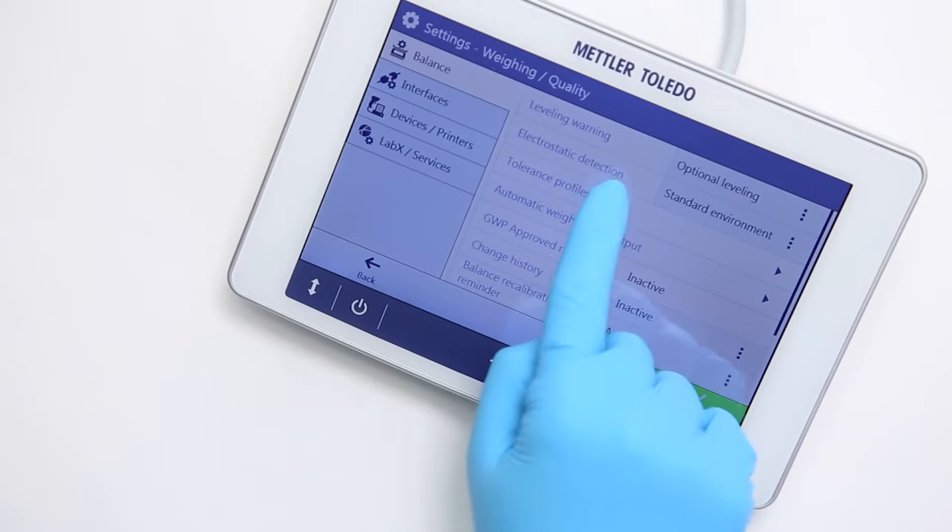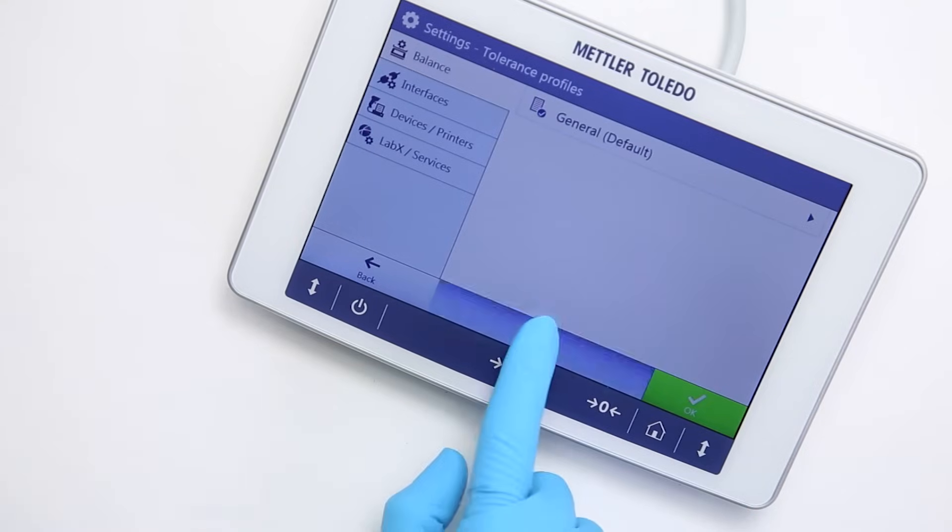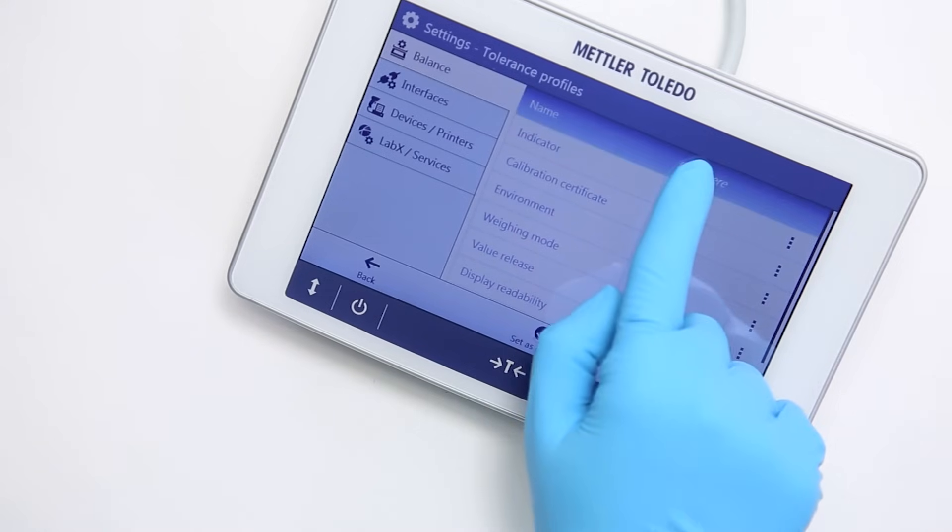The third quality assurance feature are the tolerance profiles. They ensure weighing tasks and results meet the defined quality, regulatory, and traceability requirements.